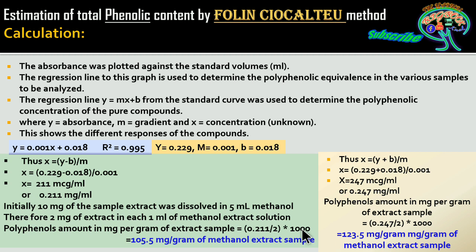When you multiply, it gives 105.5 milligrams of phenol present in a gram of methanol extract sample.